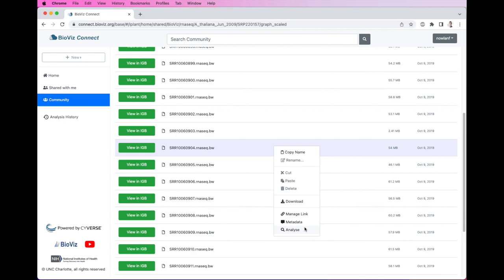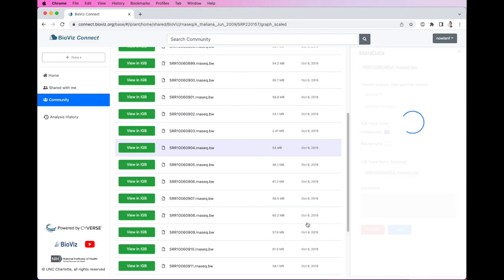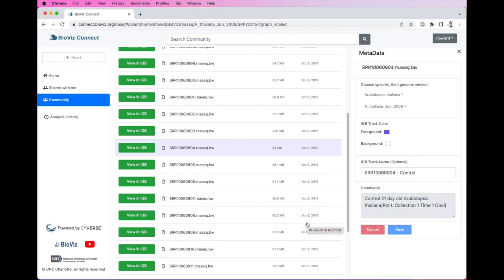The Metadata Link allows us to view additional information about the file, which we need as our file names are not the most descriptive. BioViz Connect allows us to add metadata to files, so here we can see that this is a 21-day-old control. I've also added IGB-specific metadata, so when we view this file in IGB, the file's metadata such as the track name and color will be transferred. This is great, as we can get all of our samples labeled and colored just the way we like, and all of that information is safely stored in CyVerse and then immediately available in IGB when we load the data.